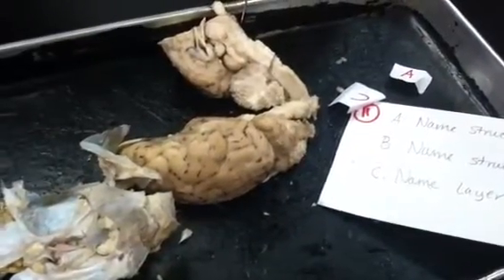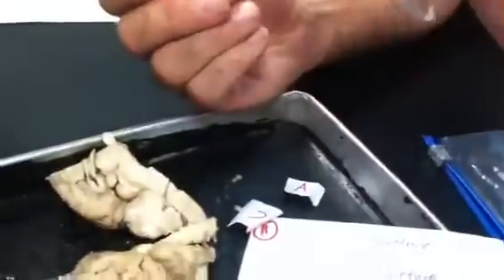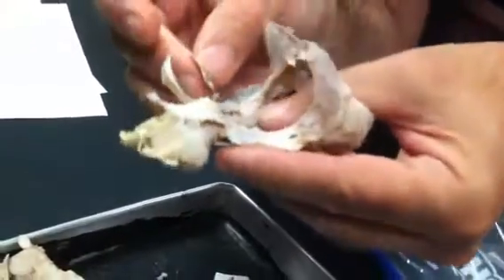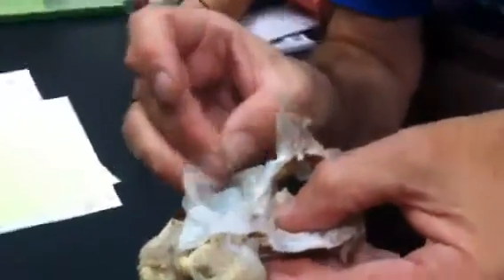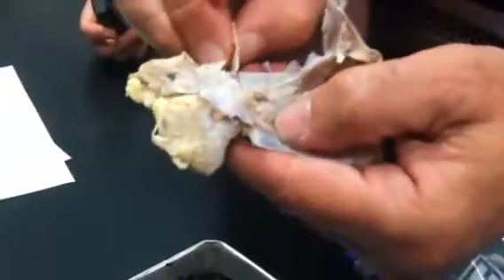Did the infundibulum. You can't really see it. It's almost impossible to see on this one. It should come off the top of the pituitary and tears away when the dura is torn away. Here's the pituitary right here. And the infundibulum is that stalk of tissue that links the pituitary to the hypothalamus.